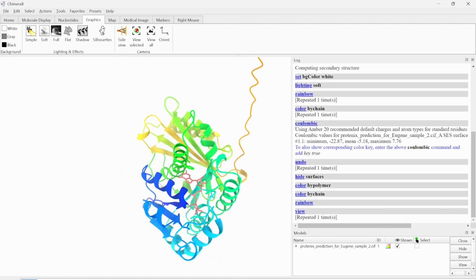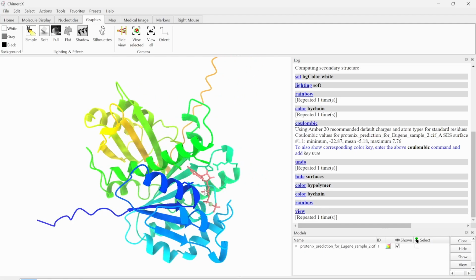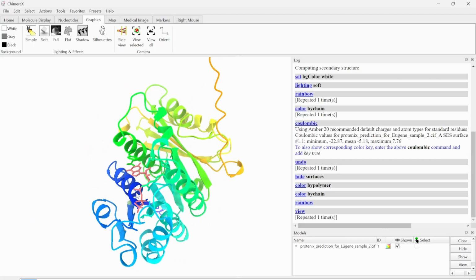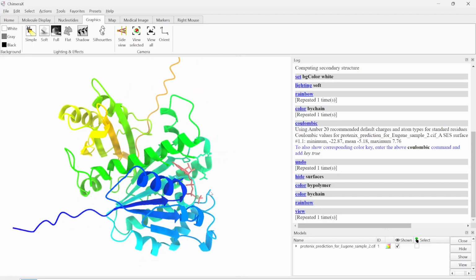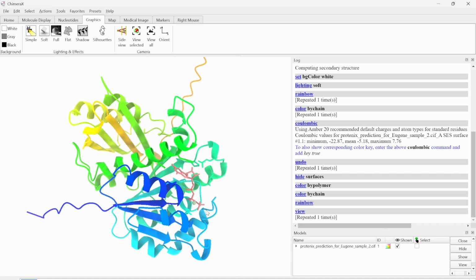As for the disordered region, it is obviously of low confidence, as the training dataset likely contain almost no disordered parts. Those are very hard to determine experimentally, but in this case it is actually of no difference to me, because I am not modeling anything related to the disordered regions.